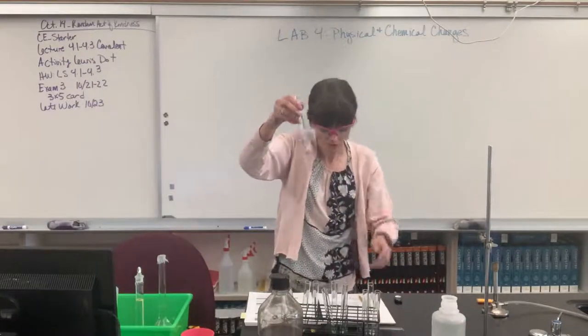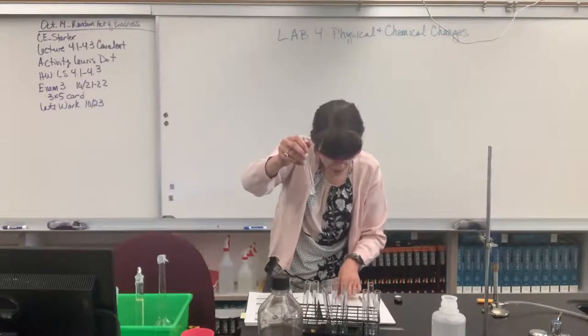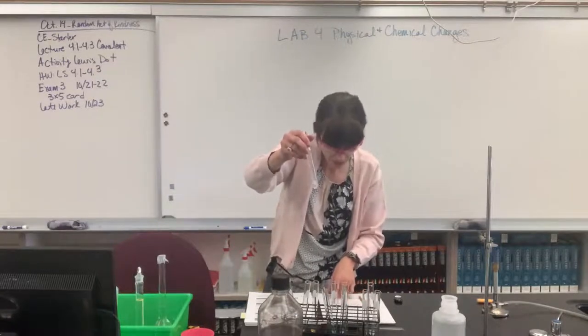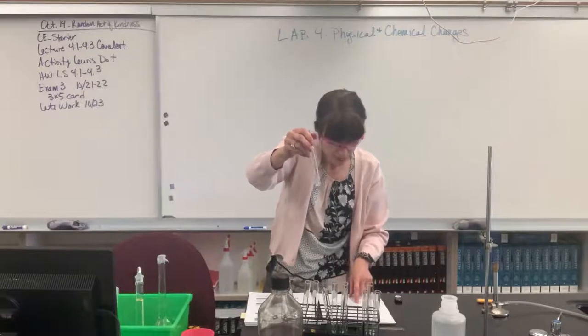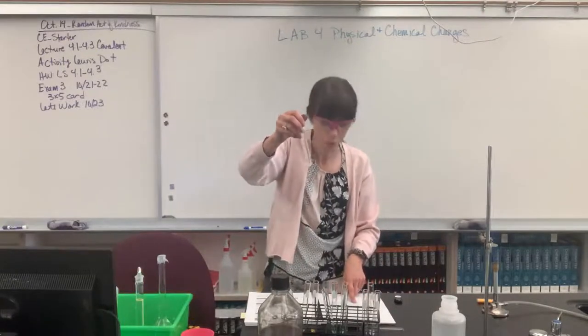Great. Okay, so let me shake that for you. We're gonna let that dissolve. Now it says to agitate the test tube until it dissolves. Number six, recover the dissolved solid from the solution by evaporating away the water.